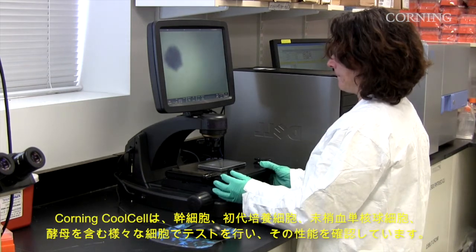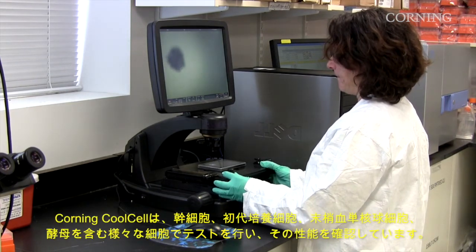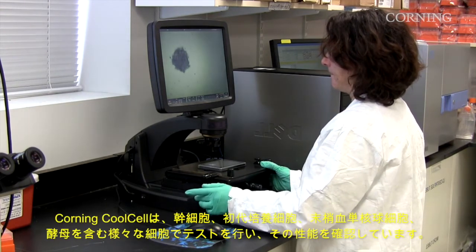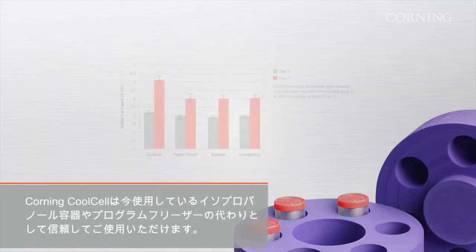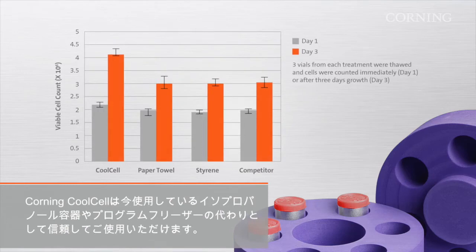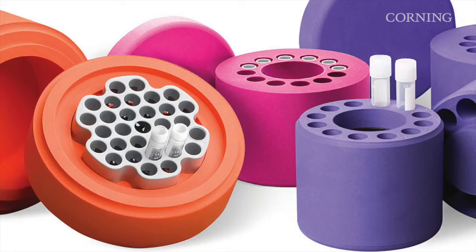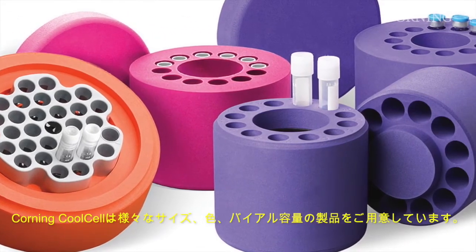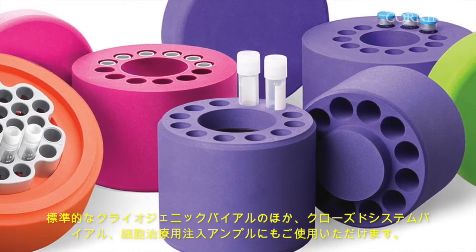Corning Cool Cell has been performance tested for a variety of cell types including stem cells, primary cells, PBMC, cell lines, insect cell lines, and yeast. So you can confidently replace your IPA container or controlled rate freezer with the Corning Cool Cell. Corning Cool Cell is available in a variety of colors, sizes, and vial capacities.